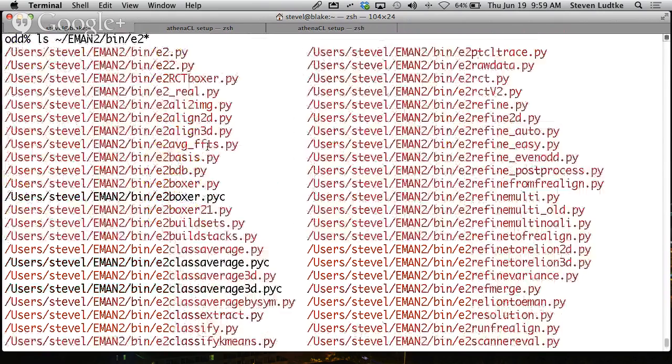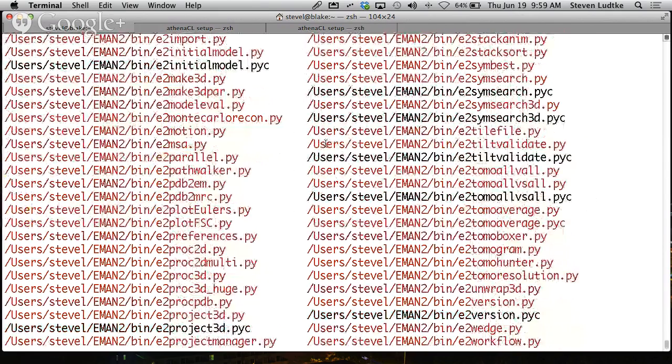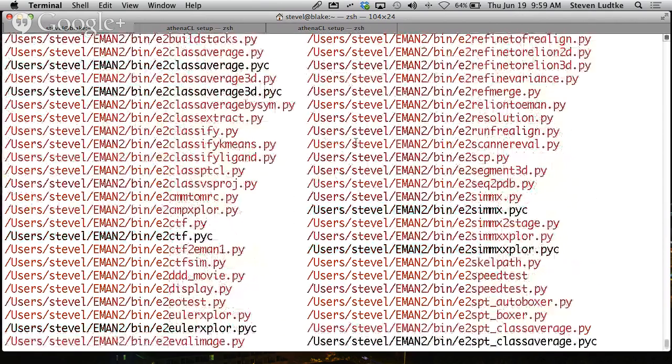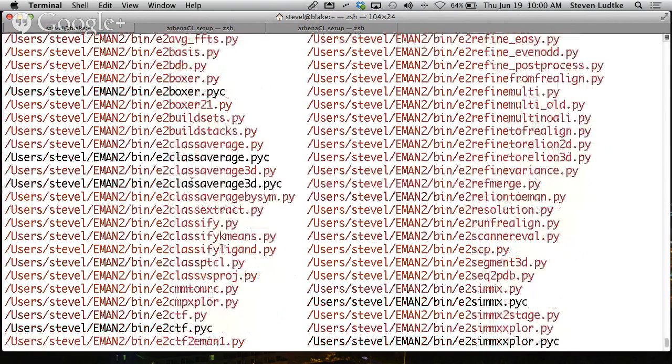I thought it was E2 extract or something, but maybe E2... See, even I don't remember the names of all the programs. E2 classes extract. Thank you, Zhao.